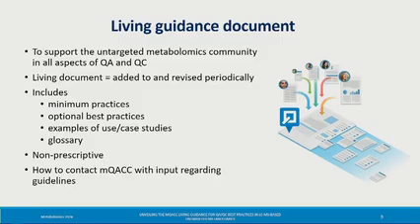So it includes minimum practices, things we think you absolutely should be doing in your untargeted experiments, optional best practices, examples of use cases and case studies that you can refer to help you design your QA and QC as part of your experiments, and it is intended to be non-prescriptive. So it's a reference, it's not supposed to tell you exactly how to do everything. And we want it to be very clear that you can contact mQACC with input regarding the guidelines, and we want to make it clear how you can get in touch with us.